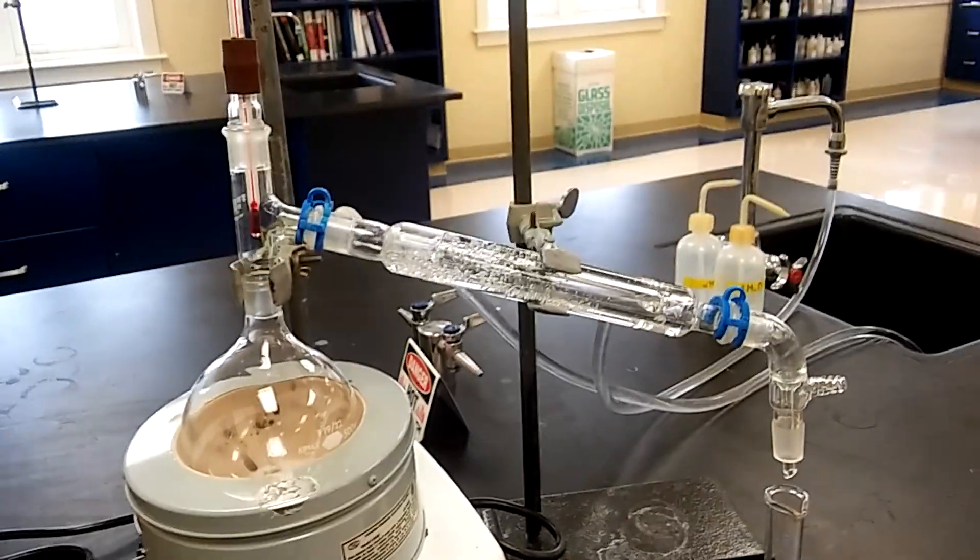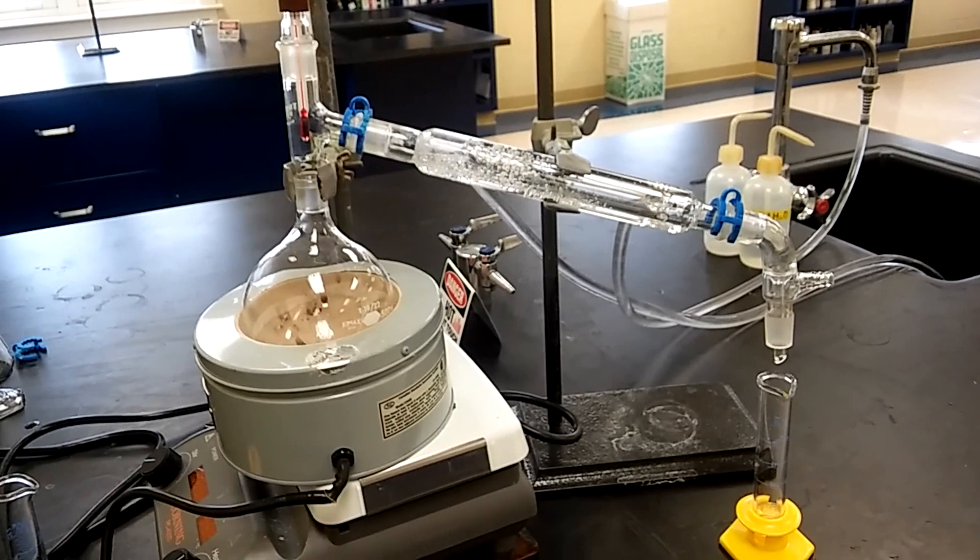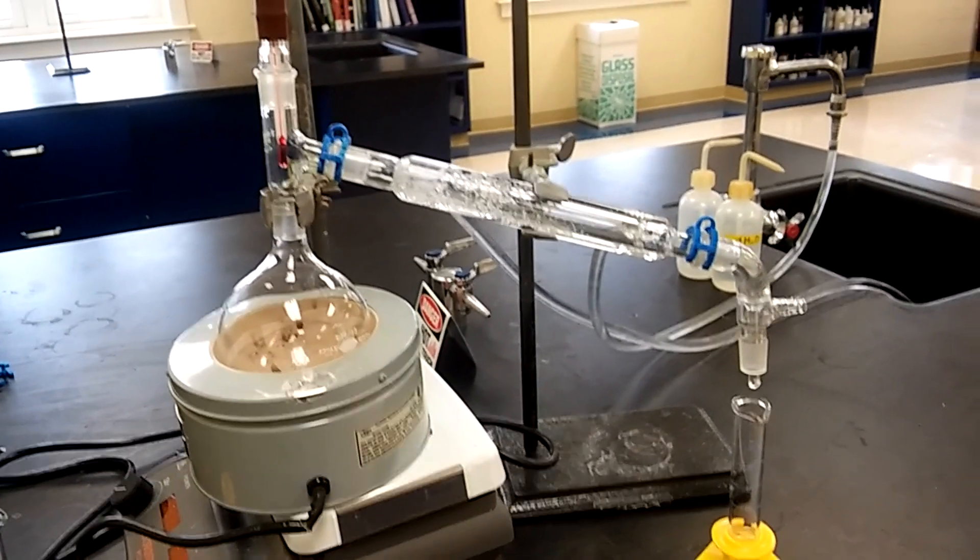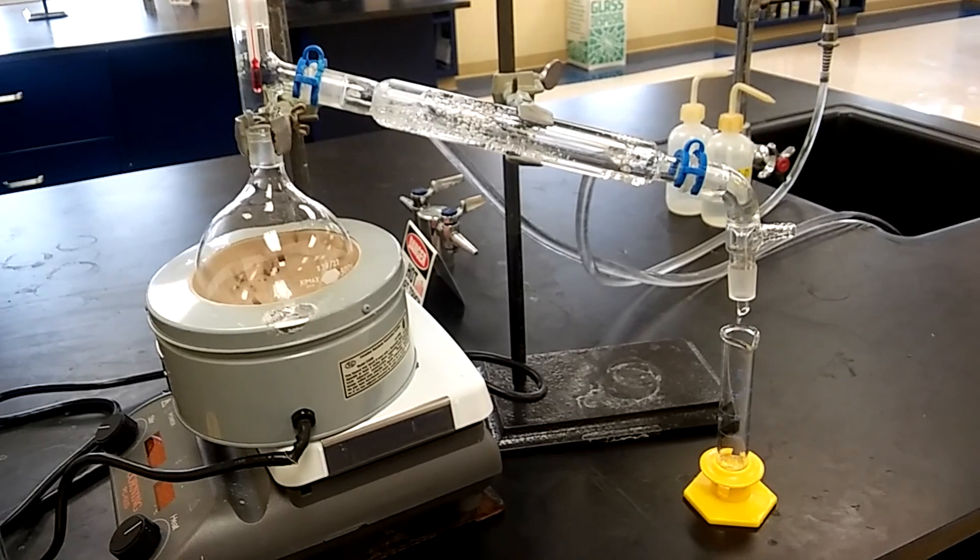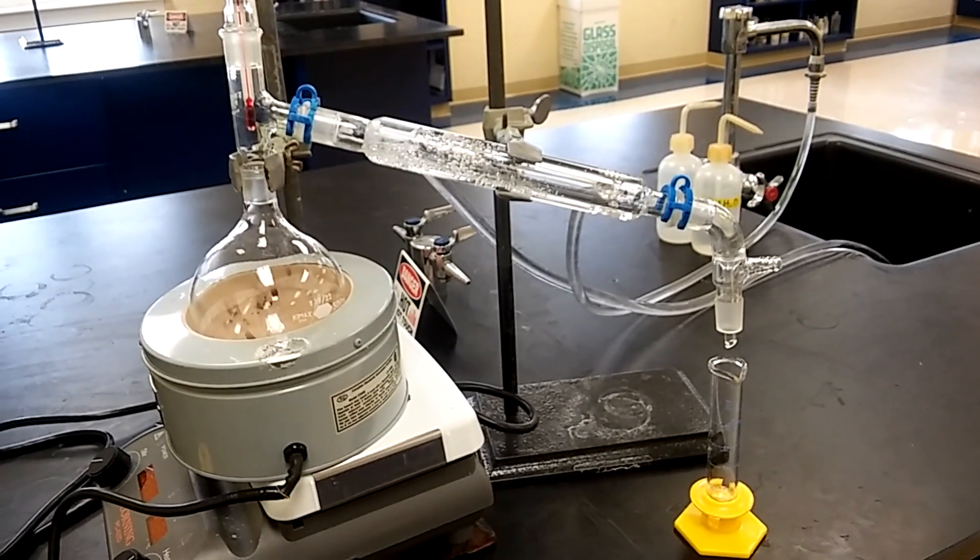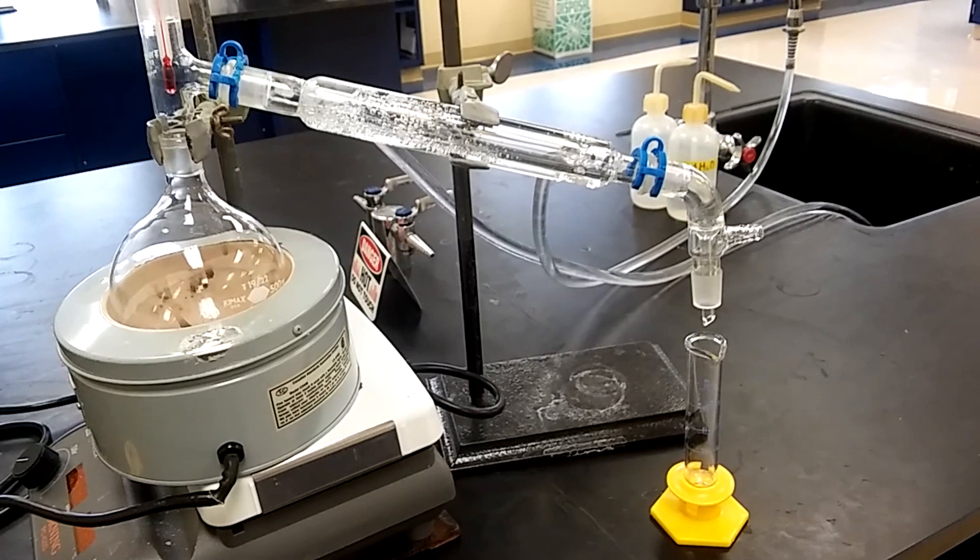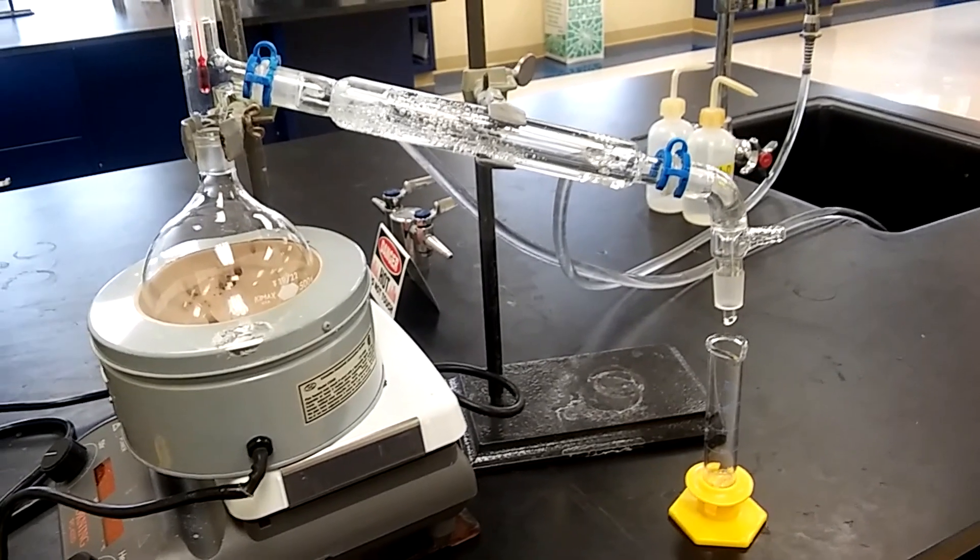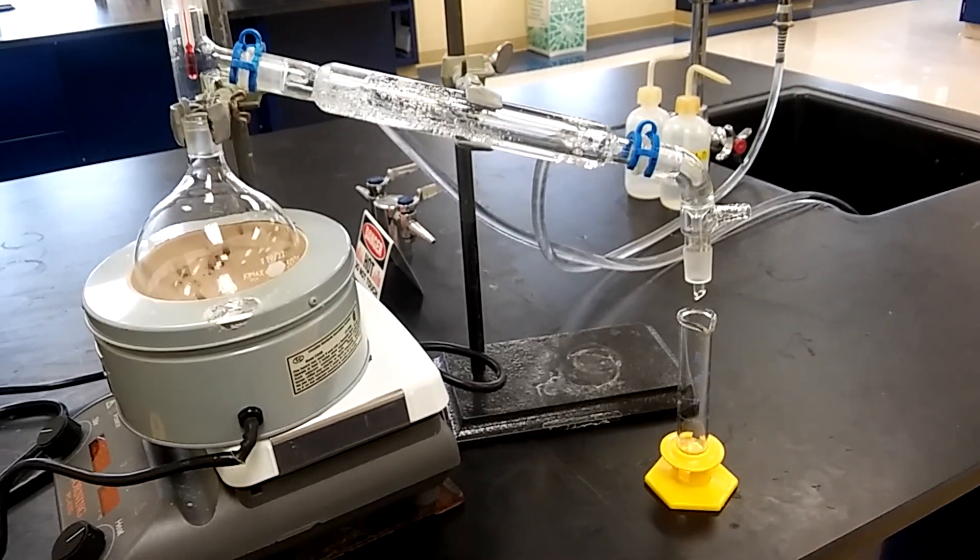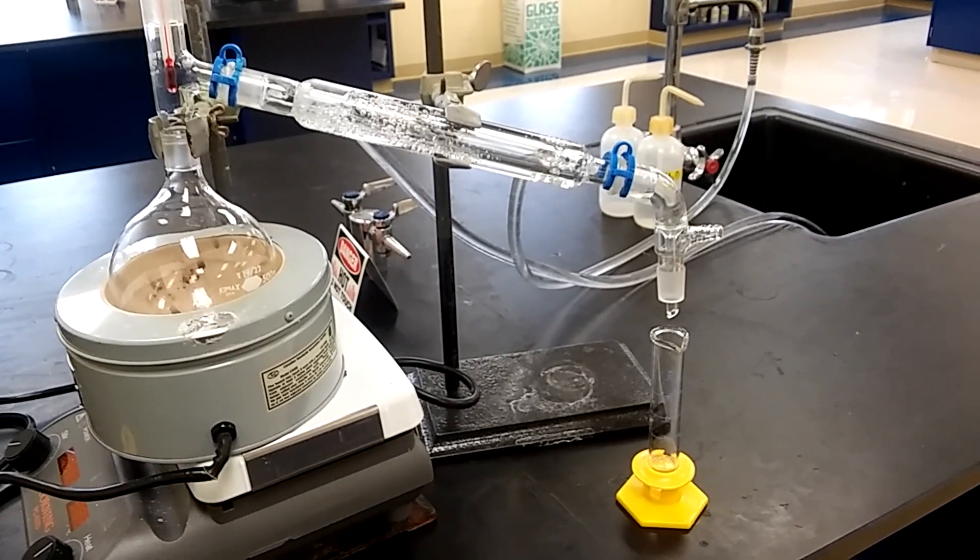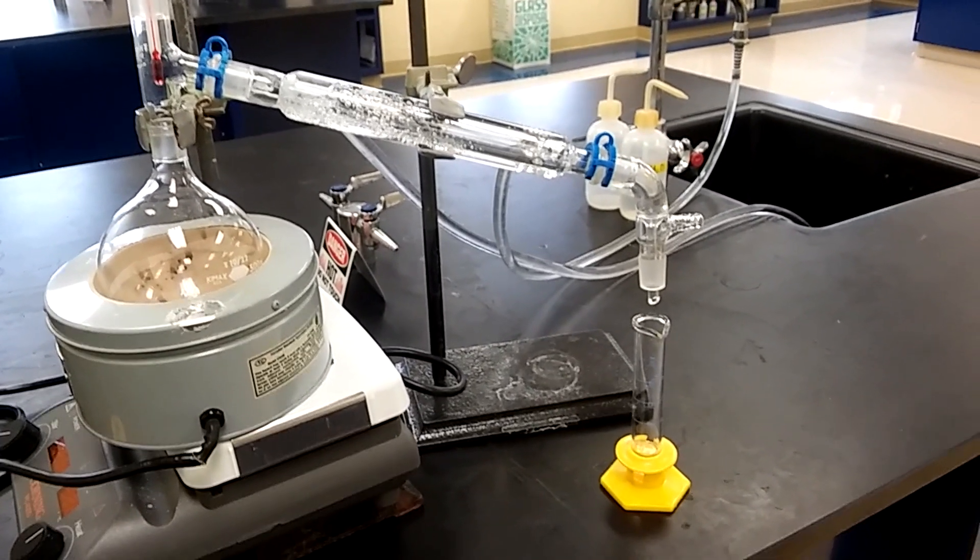You can follow the handout or my video, whatever works for you. We're collecting pure t-butyl chloride in that measuring cylinder. Once I get past 52 I'm gonna just put another beaker, turn off the heat and cut off the water supply. Then we can calculate the percent yield.